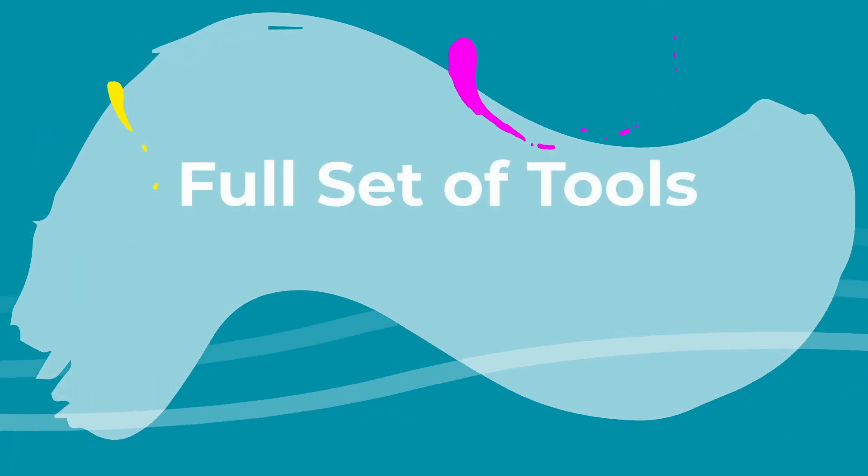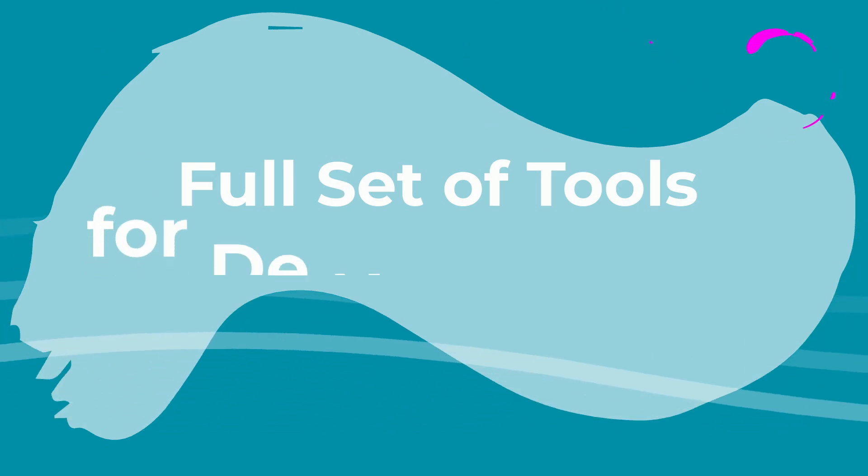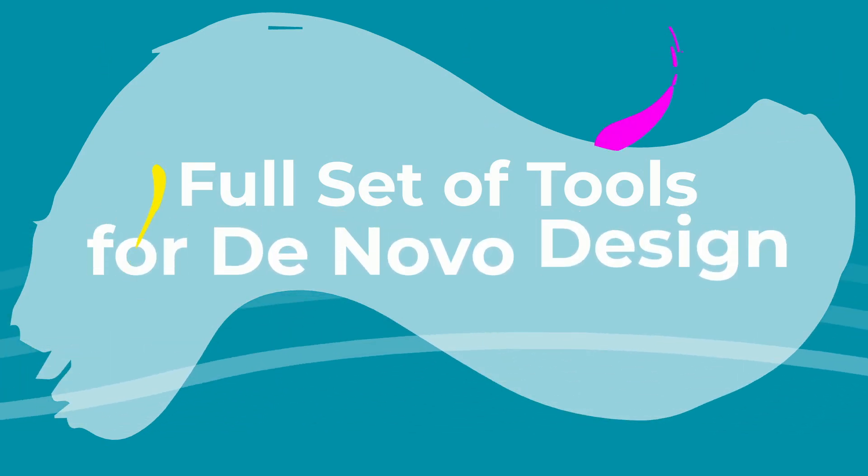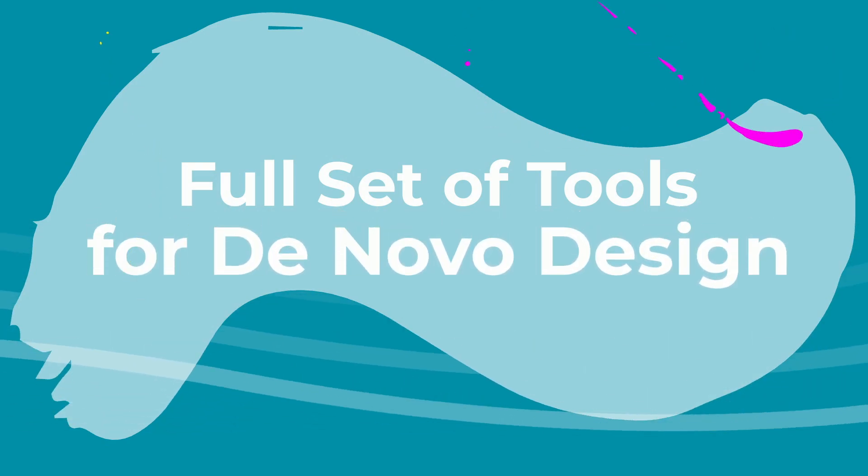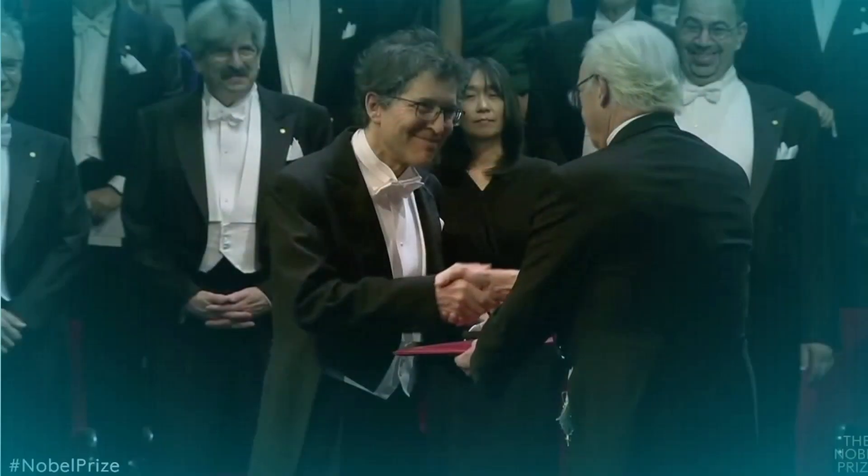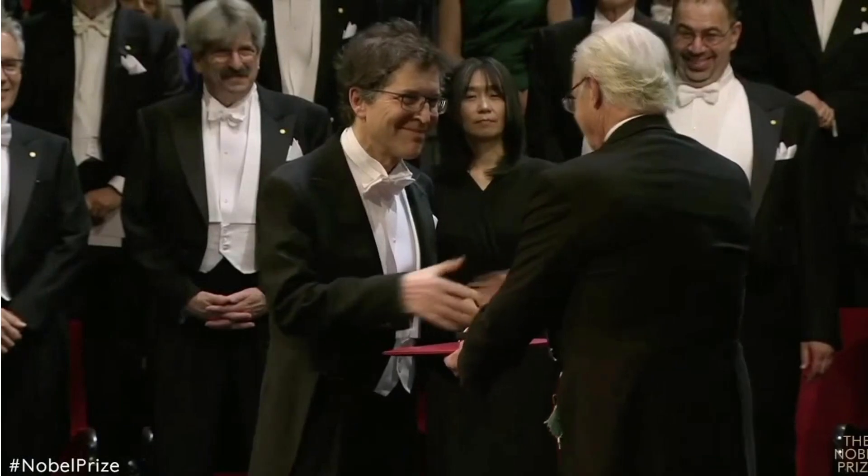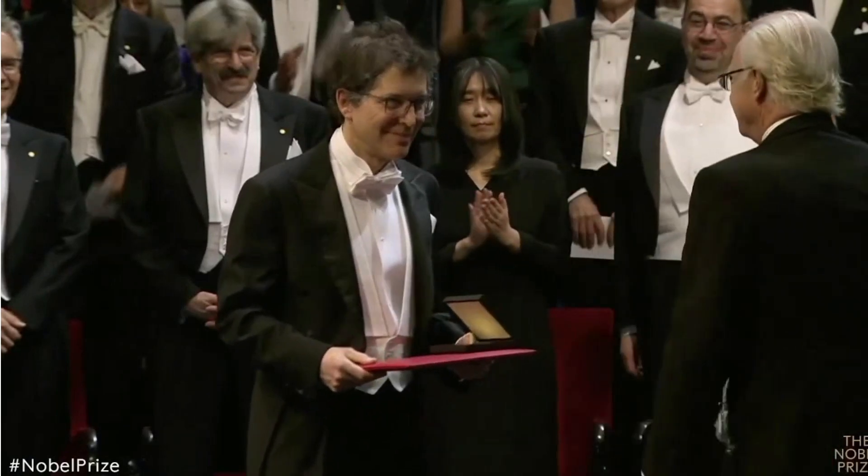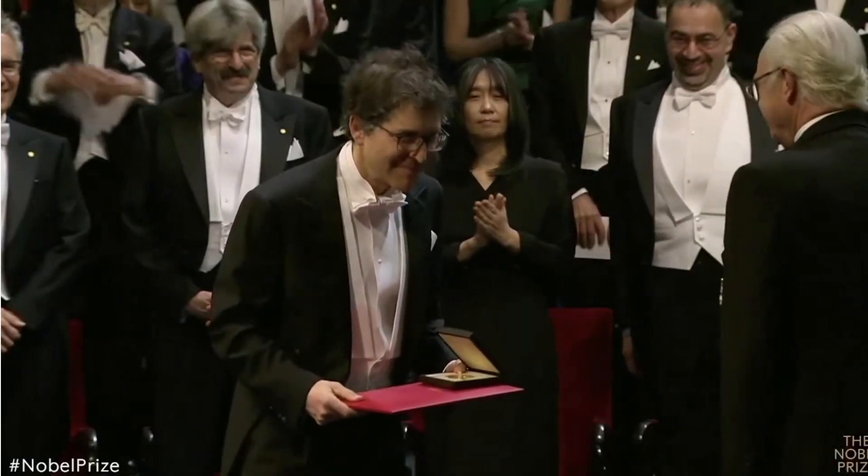Levitatebench now has the full set of tools for the de novo binder design pipeline that earned David Baker his Nobel Prize. These are the common steps in that pipeline.